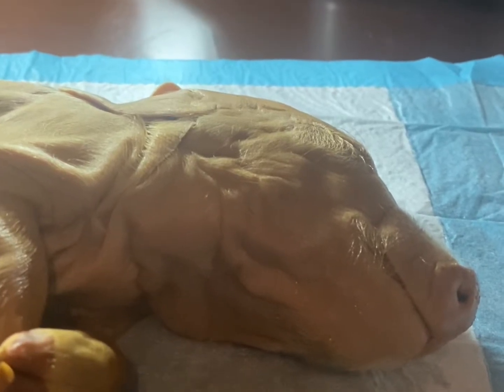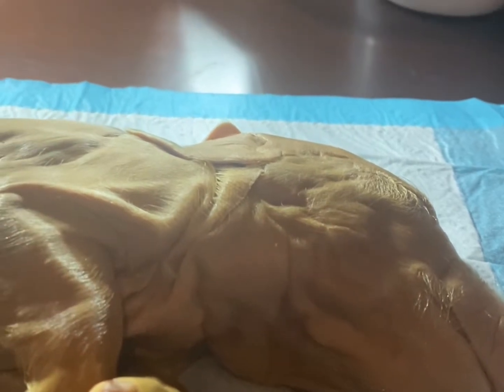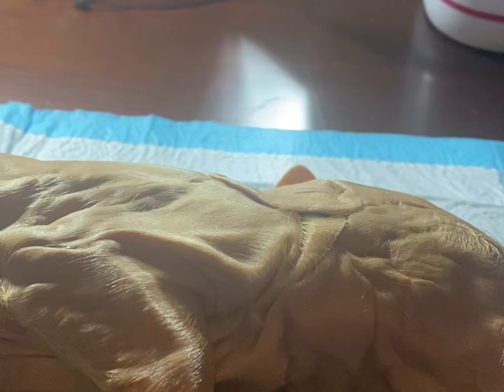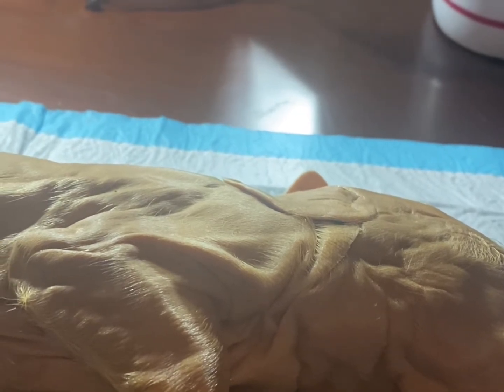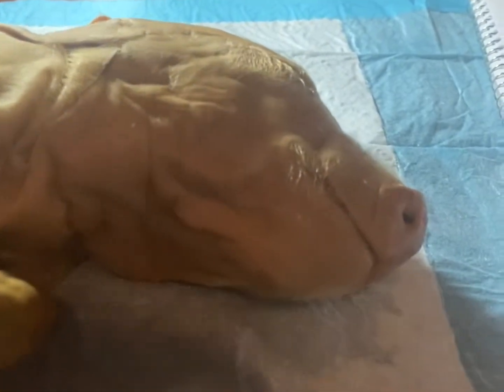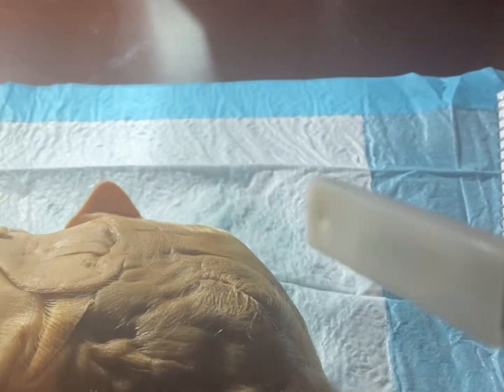Okay, so first and foremost, we're going to start with the exterior region of the pig. We were asked to identify the head region, the neck region, the trunk region, and the tail region, as well as identifying the gender of the pig. So we're going to begin with the head region. The head region encompasses all of this region of the animal.